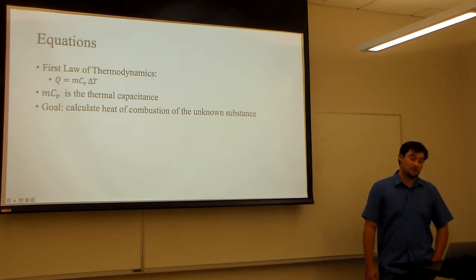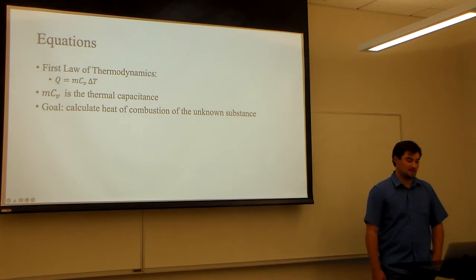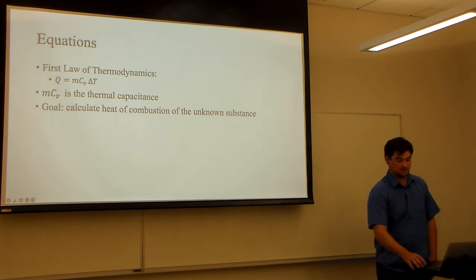So as far as equations go, we used one, which was from the first law of thermodynamics. And I talked about thermal capacitance earlier, that's the MCV value. And the goal is to calculate the heat of combustion of the unknown substance.